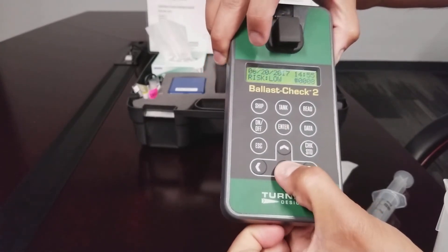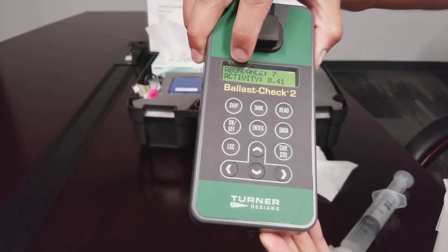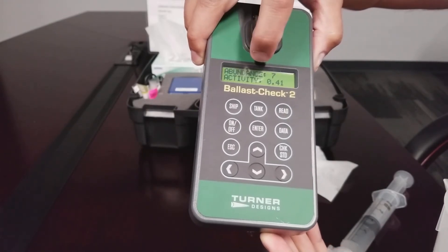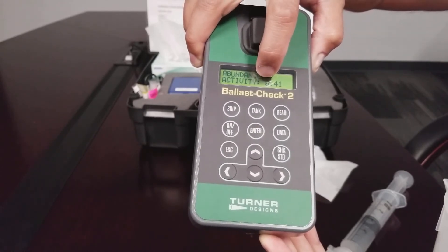Press the down arrow key to view the factors used when calculating risk. Abundance is a quantity of cells per mil. Activity indicates the health or viability of the cells in this sample.